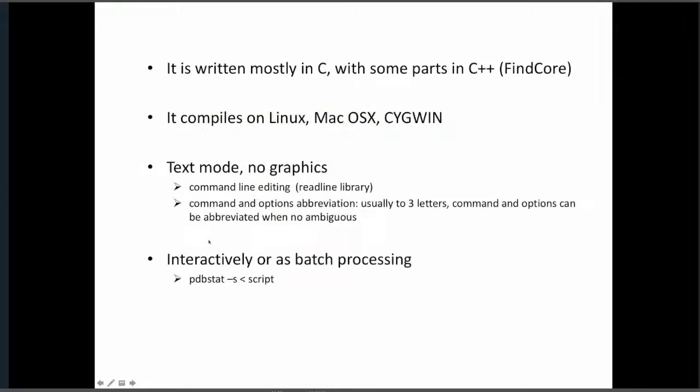Another characteristic is that it is mostly written in C, with some parts in C++ and even tiny amounts of code in Fortran.